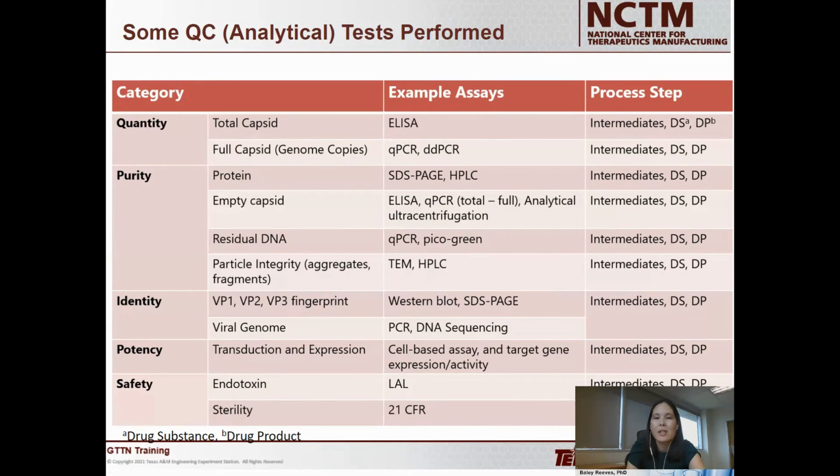And then lastly, on the QC side, obviously for release testing, there are going to be a lot of assays that are going to be required for your gene therapy products. And just for the sake of time, I'm not going to go into these in detail, but you're going to have a whole set of release criteria before those products can be released.